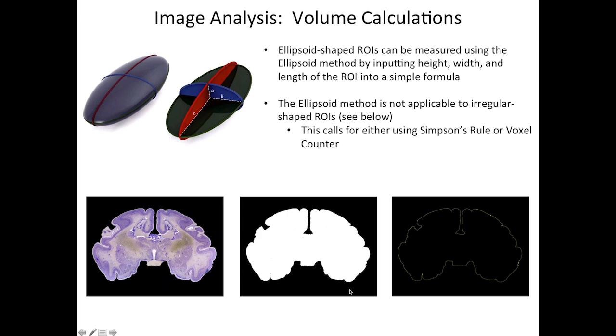So we can take these volume calculations a step further and provide really, really neat visualizations for the volumes that we calculate.